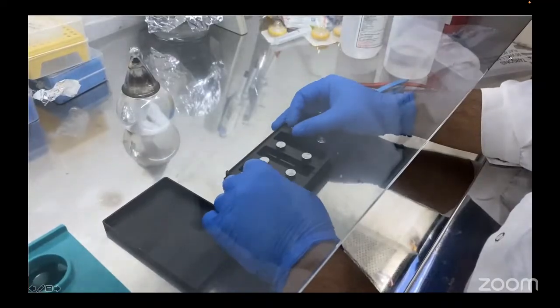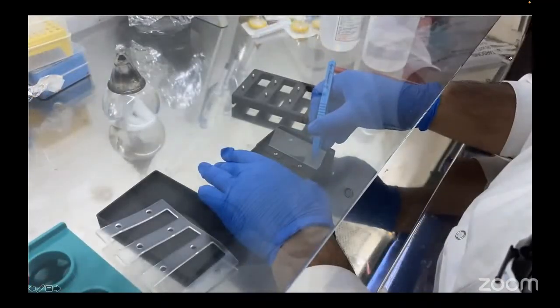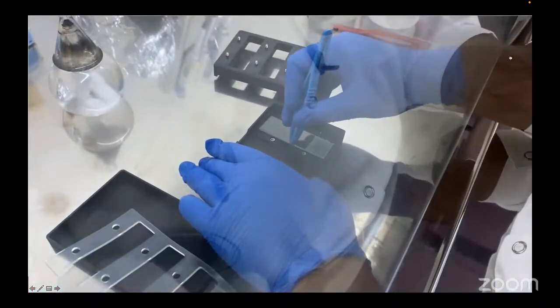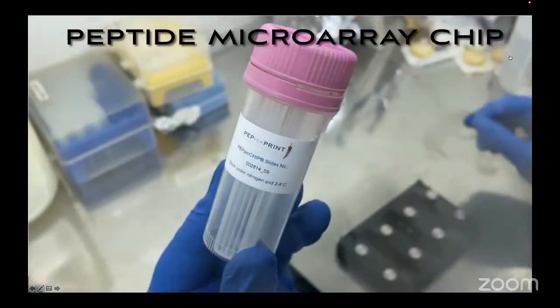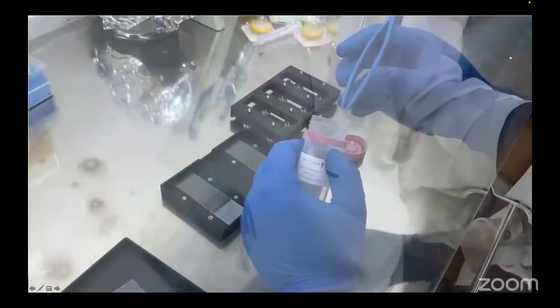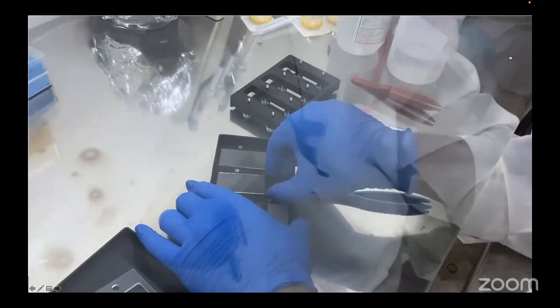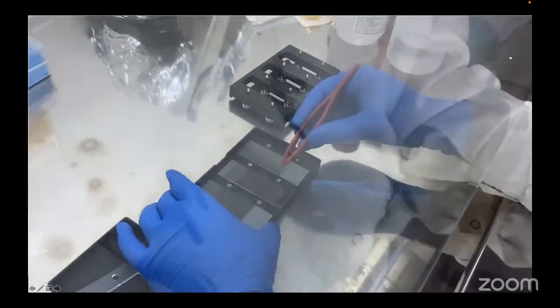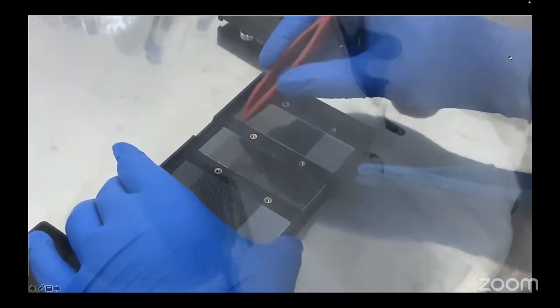Unscrew the incubation tray by slowly turning the screws diagonally. We will be using 2 blank glass slides as balancers, since today we will be using only 1 microarray chip. This is the PEPperPRINT microarray chip. Slowly take out the chip using plastic forceps and place it on the incubation tray. Align the chips properly onto the tray.